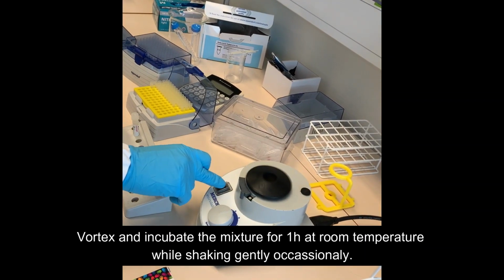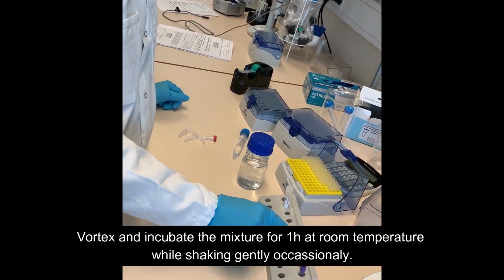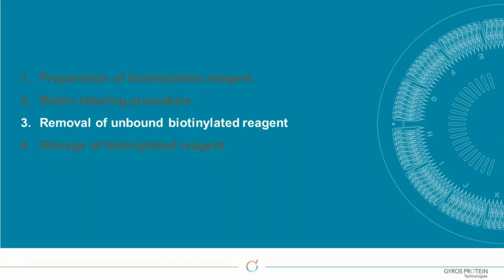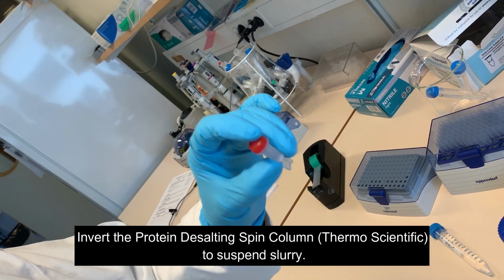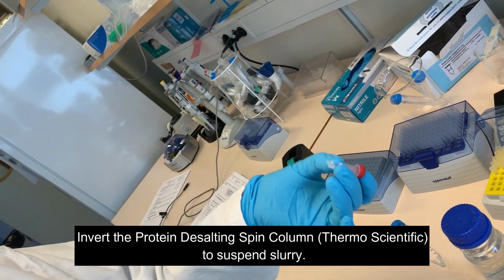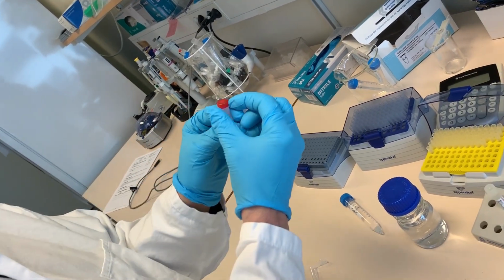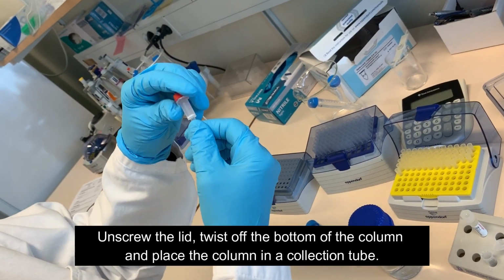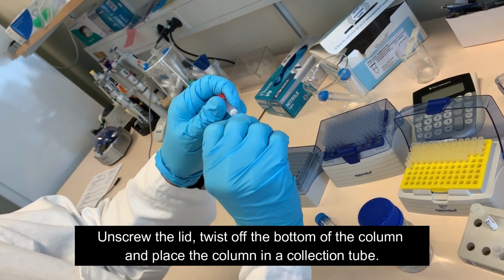Vortex the mixture and incubate it for 1 hour at room temperature. Invert the protein desalting spin column to suspend slurry. Unscrew the lid, twist off the bottom of the column, and place the column in a collection tube.